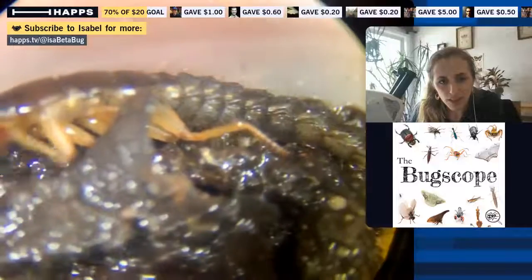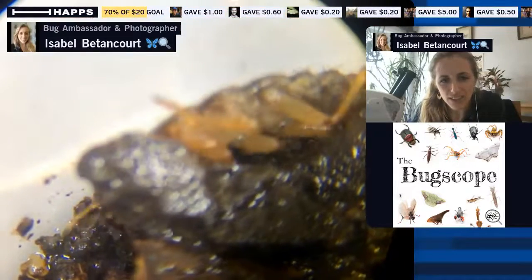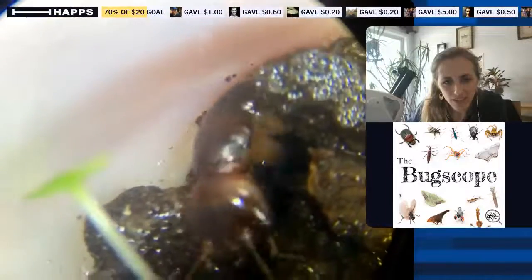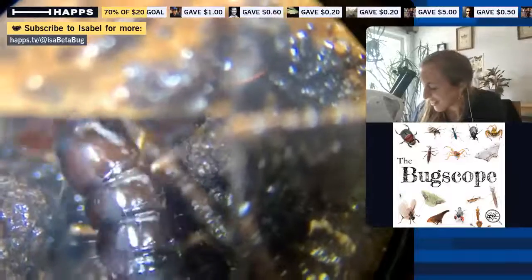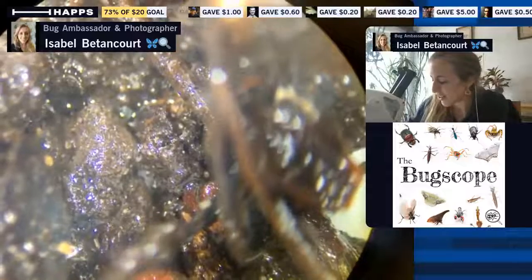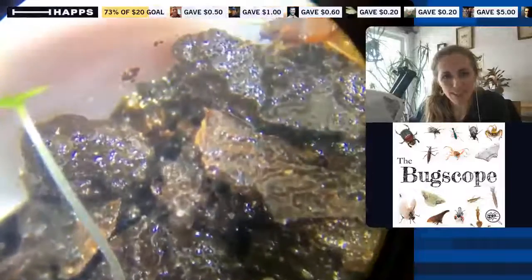That's also why insect collections are so important. You can see it has six legs, it's very mobile, which makes sense for running around. Let me zoom in and get this back in focus. It has antennae in the front for feeling, a really big strong head capsule — I'm guessing it has a lot of strong muscles in its head for biting down. It's really trying to stay out of the light. It also has those cerci — basically like butt antennae in the back. I don't really know what they're for.